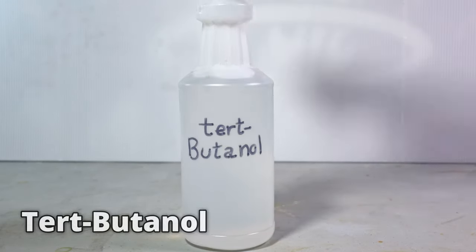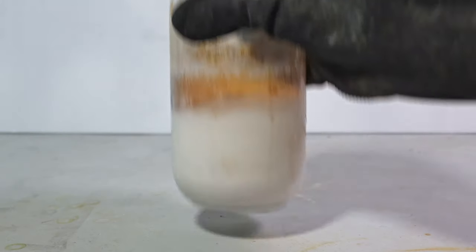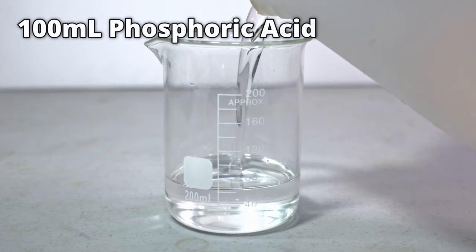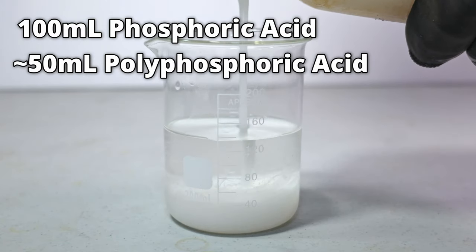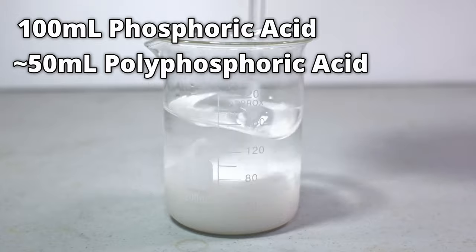The materials you need are tert-butanol, phosphoric acid, and polyphosphoric acid. The first thing we're going to do is mix 100 milliliters of phosphoric acid with 50 milliliters of polyphosphoric acid. This will remove all the water in the solution while keeping it relatively mobile.